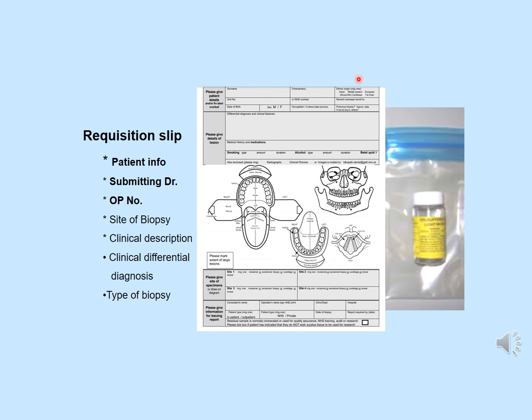Now, filling this out is very important. Why do I say it's very important? Because if you mix this up, let's say there are two biopsy procedures done and you mix up patient information, it has a huge impact on the treatment. It has a huge impact on what is going to be conveyed to the patient. Imagine if you do that between a benign lesion and a malignant lesion, it could be disastrous.